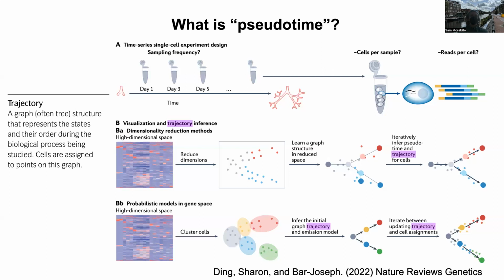Do the spacings have to be the same for each? I mean, it probably doesn't have to be, but that's a good consideration. This is where, if you were smart, you would do the experimental design in line with what kind of data analysis you want to do, which never really happens.